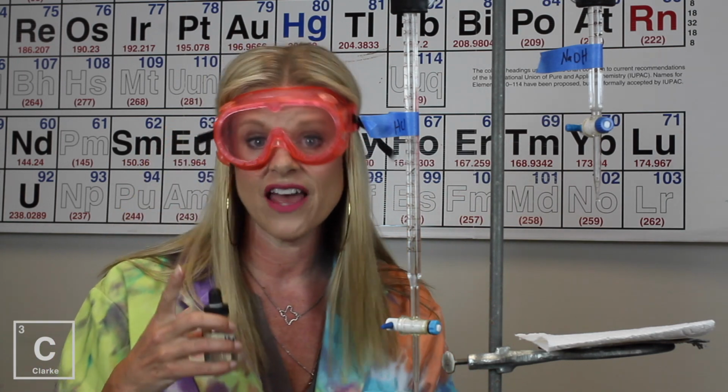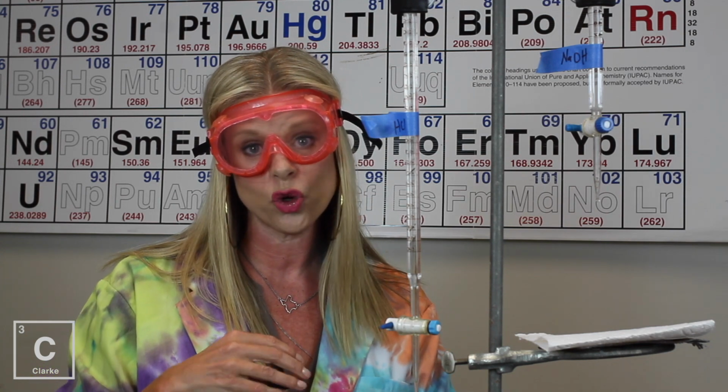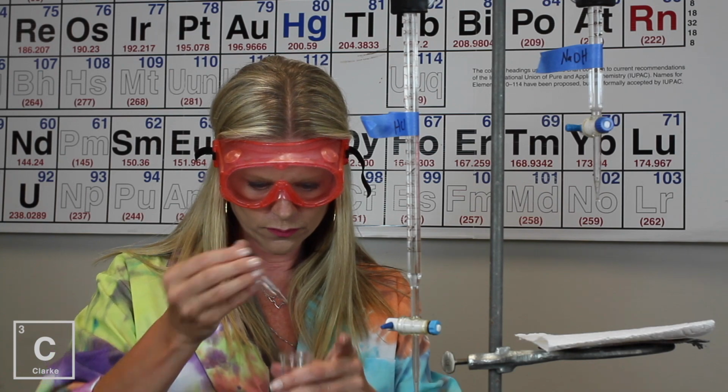If you remember back to that very first lesson in this series, phenolphthalein is an indicator that turns pink in the presence of a base. And since my flask only has hydrochloric acid, it should still remain clear. Swirl that around, make sure it's all good and mixed up.